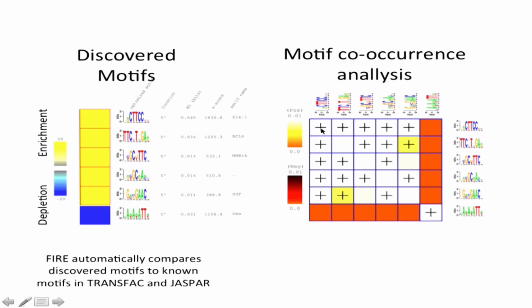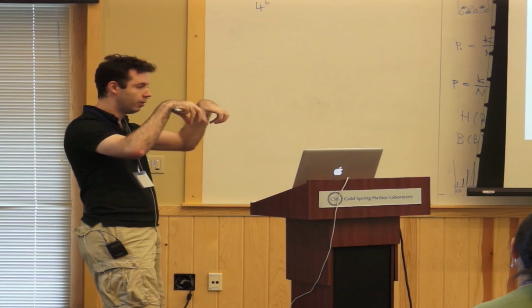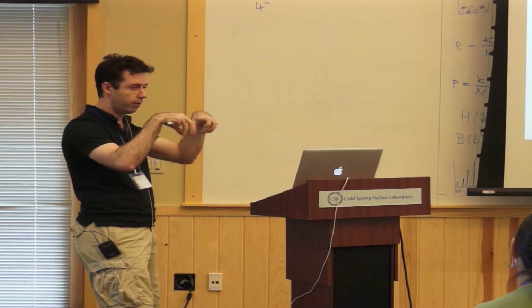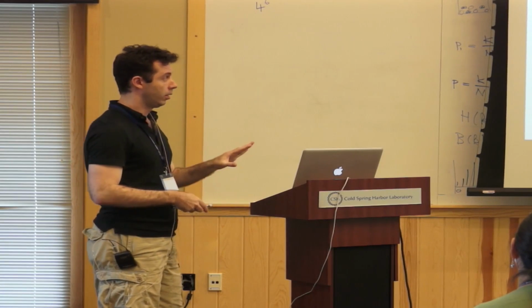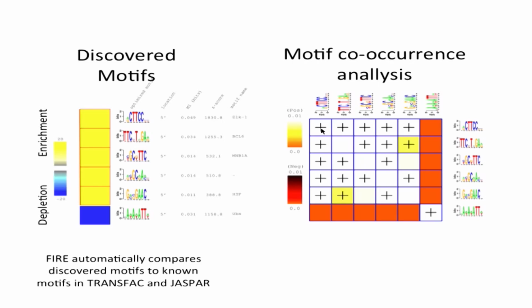But it also tells you something about the tendency of the proteins that bind to these motifs to actually work together, potentially as a protein complex, factor and cofactors. Again, the point here is that by doing this motif analysis, you can reveal a lot of really interesting biology about your ChIP-seq experiment, not only by the motif enrichment, but also by the co-localization of motifs within your peaks.